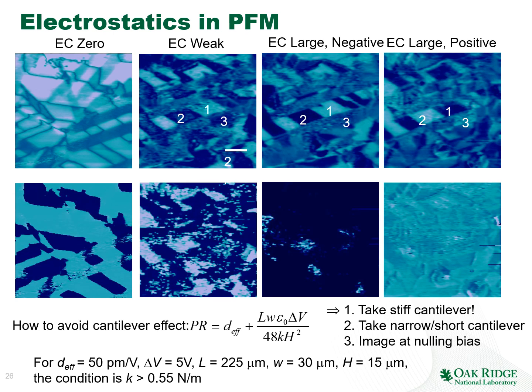So here, the domain has the true polarity, 1, 2, 3. Here, they still have correct polarity, but it is amplified. And here, the polarity is actually inverted, because here the electrostatic and electromechanical interactions add up, and here the electrostatic and electromechanical interactions get subtracted from each other.